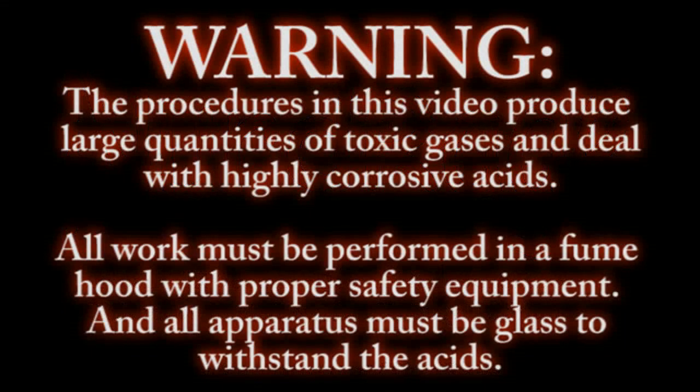Warning: the procedures in this video produce large quantities of toxic gases and deal with highly corrosive acids. All work must be performed in a fume hood with proper safety equipment, and all apparatus must be glassed to withstand the acids.